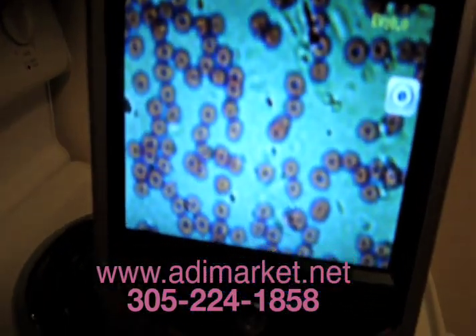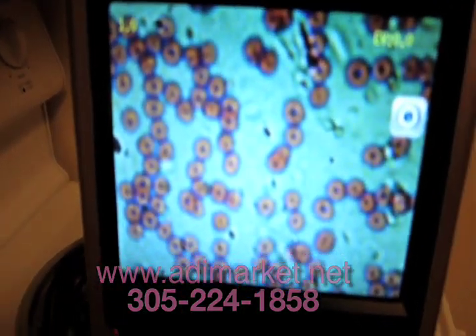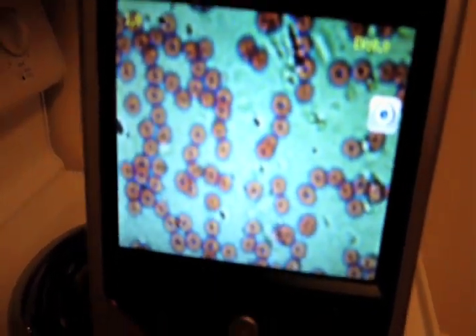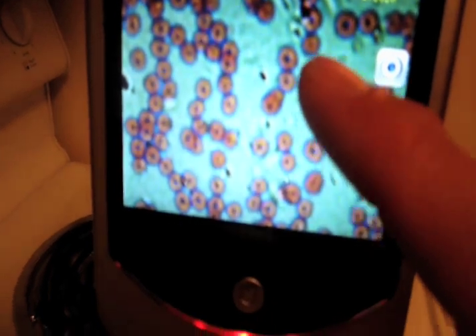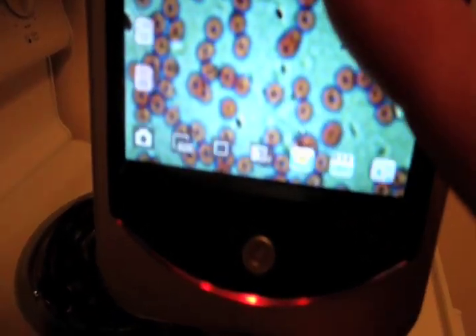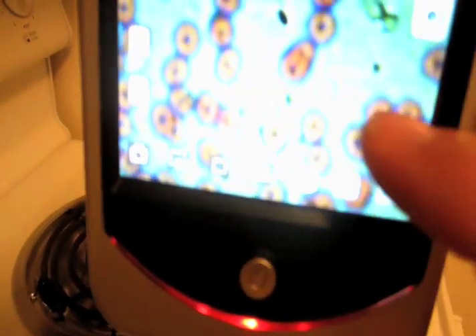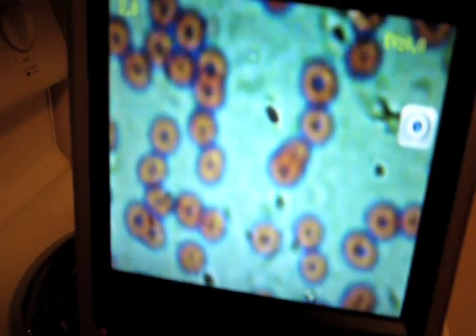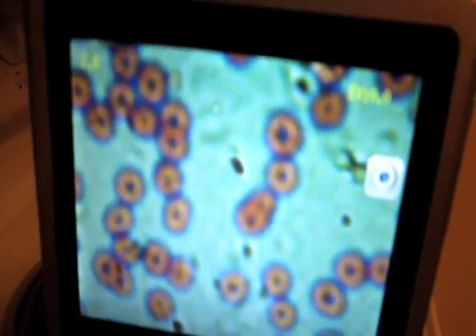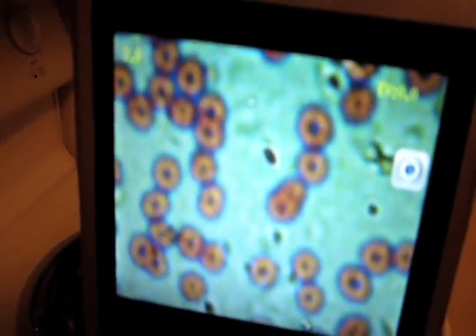Lo and behold, here we have the donut-shaped human blood cells. You can see them there — very neat. You can get a larger view, what they call a digital enhancement, by activating here and pulling it out. It will blow up your image. There are your characteristic donut-shaped hemoglobin cells that carry oxygen through our body.